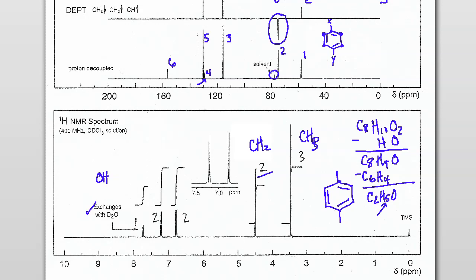All right? Now C2H5 is very common for ethyl. So we really have 2 possibilities. We could potentially have an OCH2CH3, or we could have a CH2OCH3, and this would be attached to the ring, most likely. So when you take a look at this, you should probably be able to figure this out at this point if you've been following the course along. But it's going to be the second option for several reasons.